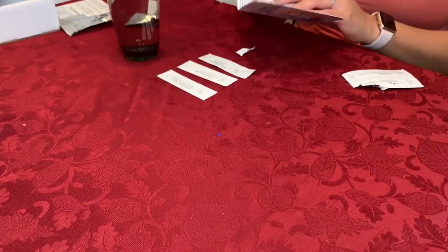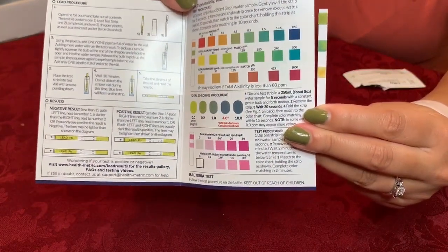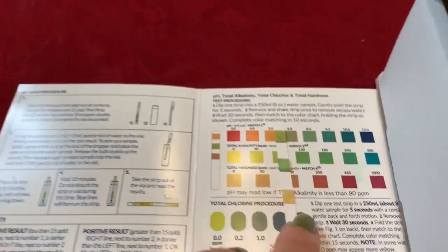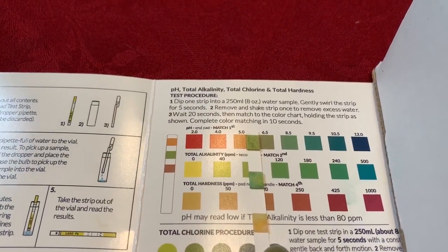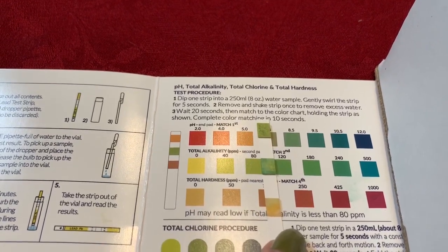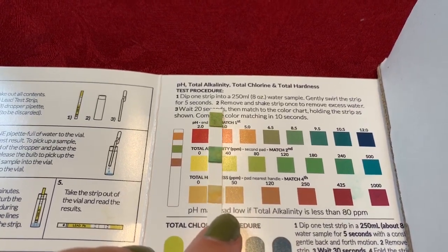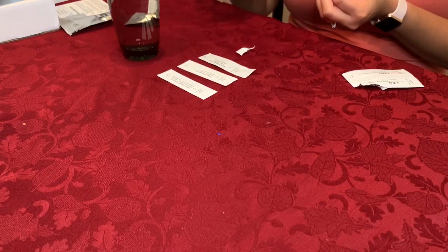It looks like our 20 seconds is up. Now we can match the strip to the color corresponding to each test. So probably a pH of 6.5, total alkalinity of maybe 80, and then total hardness closer to zero. And based on those standards, that's still pretty good.